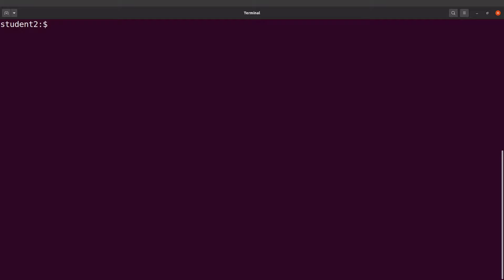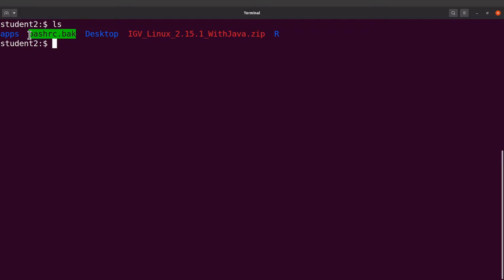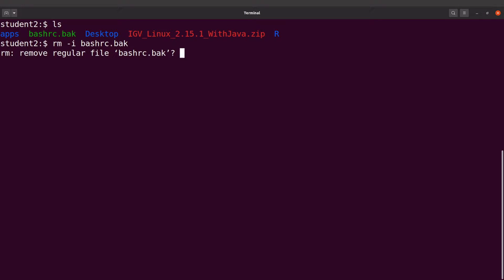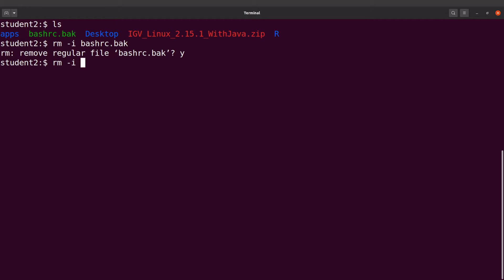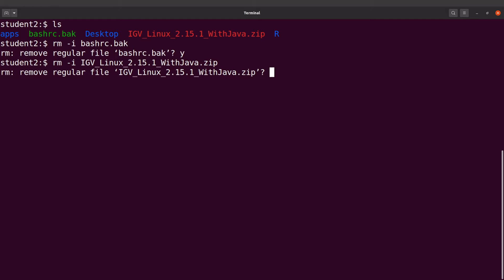Now let's clean up. Doing an ls in the home directory we see the backup file .bashrc.back. I'll remove it with rm -i and confirm with Y. I'll also remove the downloaded zip file — it's optional, but I no longer need it, so I'll use rm -i and confirm. Everything has been cleaned up successfully.